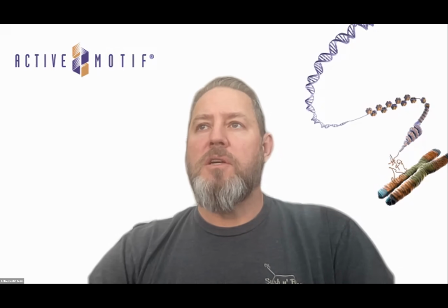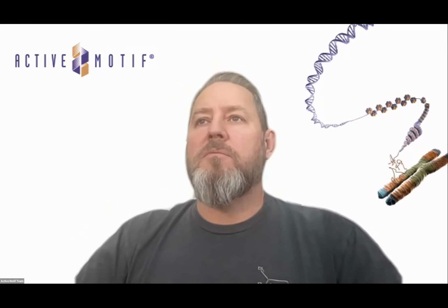A quick question from Sarantis. When you mentioned using frozen cells, which exactly? Cryopreserved, yeah. Thank you for asking this. I'm sorry if I didn't explain correctly. I mean cryopreserved, not snap frozen. Cryopreserved cells. Yeah.